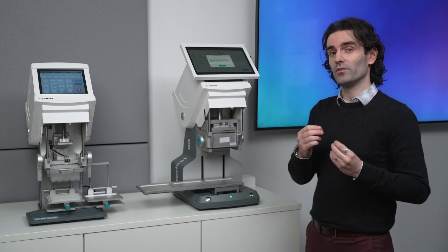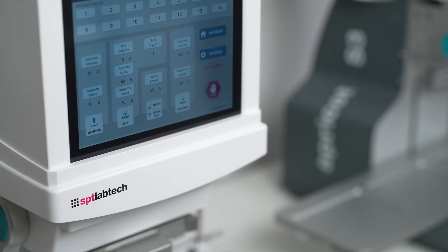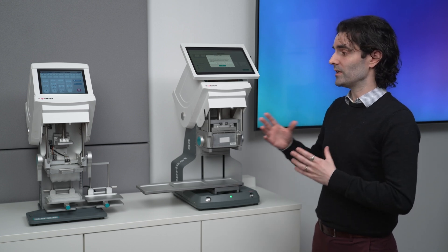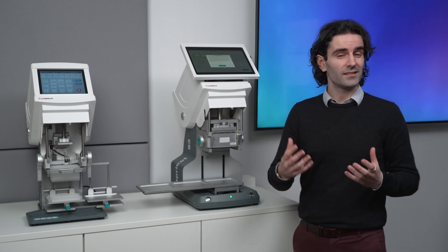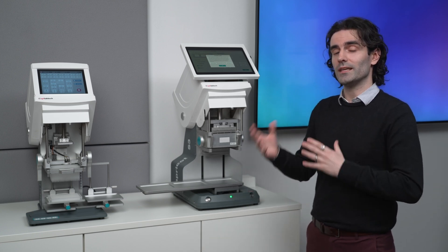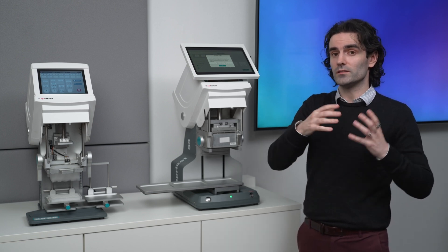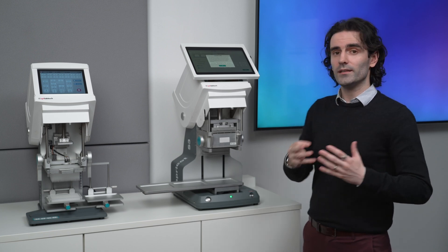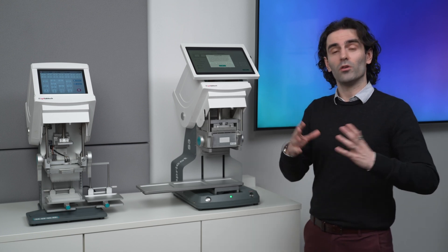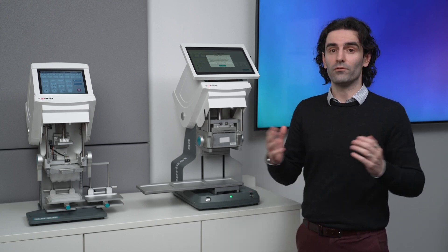With the S3, because you have the automated deck, it's also well suited for integration with other instrumentation. When deciding between the two: the S1 is great for fairly simple liquid handling tasks, and also very useful if you're trying to do something by eye — a lot of customers use the S1 when taking supernatant off a pellet and want to see exactly when to stop the deck. With the S3, many customers are automating kits with multiple steps within a workflow. But ultimately, both instruments are great for simple liquid handling tasks around your lab.